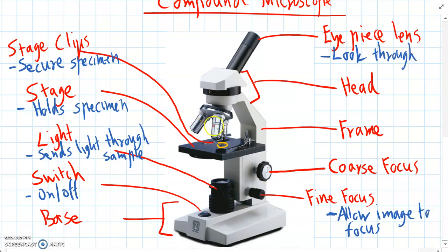And then further down there are three different lenses. One, two, and three. And these are called the objective lenses.